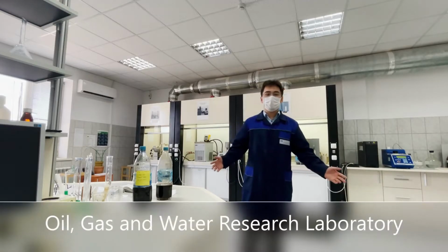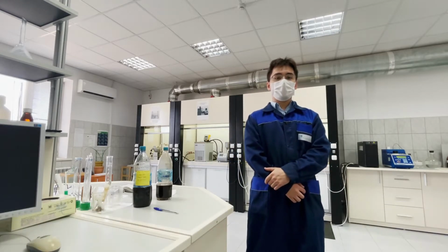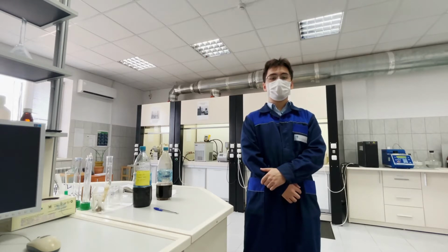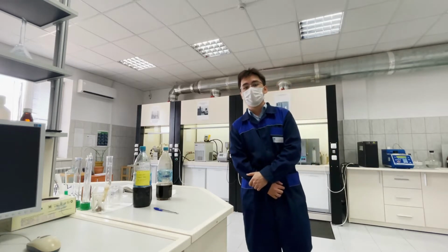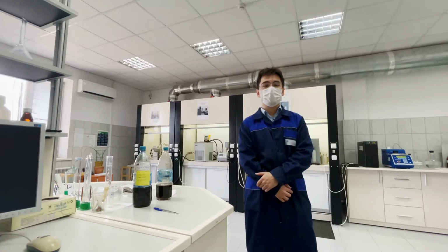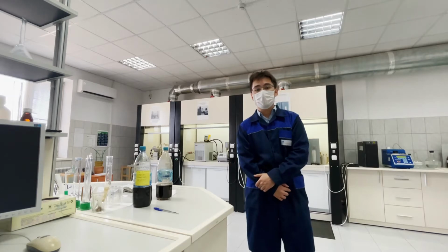Welcome to the Oil, Gas and Water Research Laboratory. The laboratory for the study of oil, gas and water is engaged in the study of the chemical composition of oil, water and associated petroleum gas. The scope of the laboratory's accreditation includes the study of crude reservoir and commercial oil, technological analysis of commercial oils, analysis of motor gasoline, oil products, diesel fuel, petroleum fuel, etc. Also, the analysis of natural associated gas and the formation water.